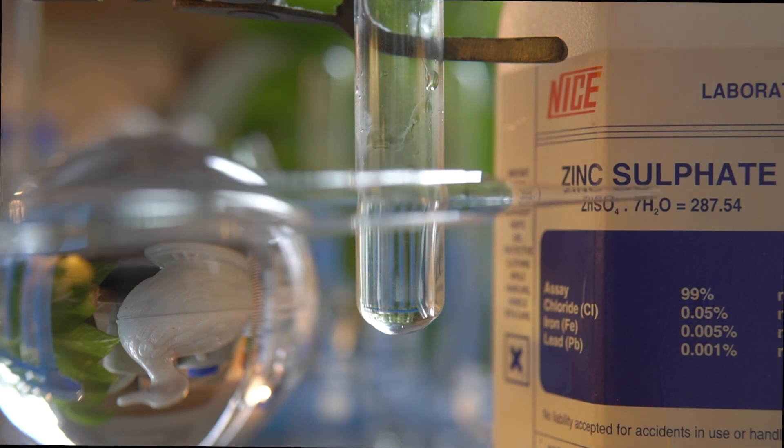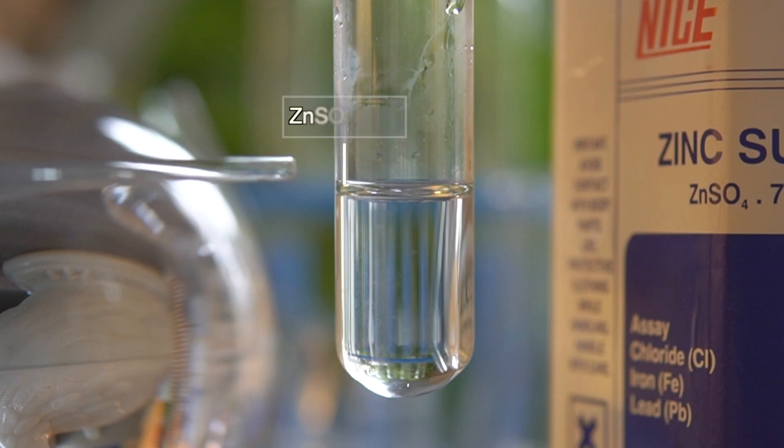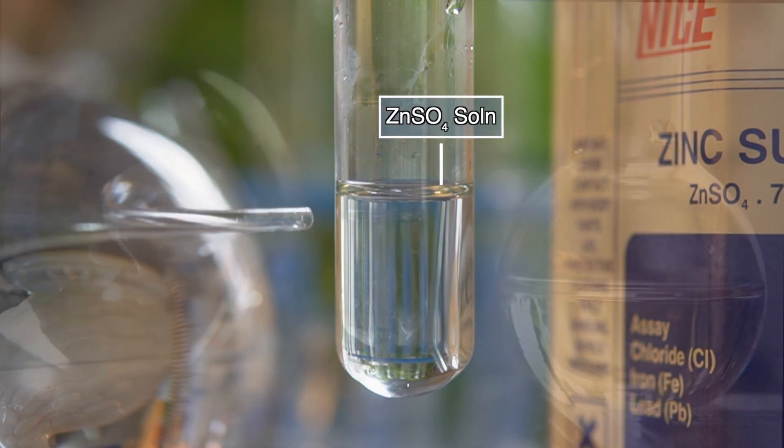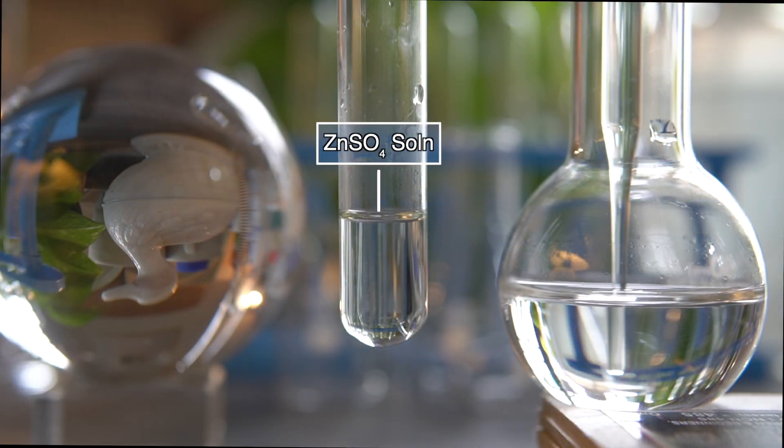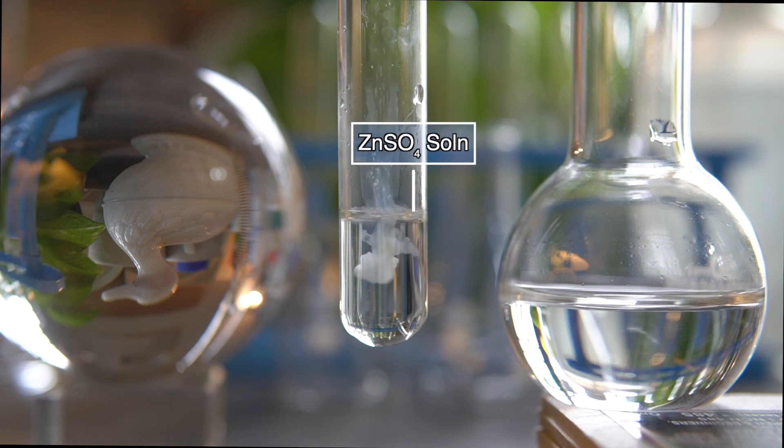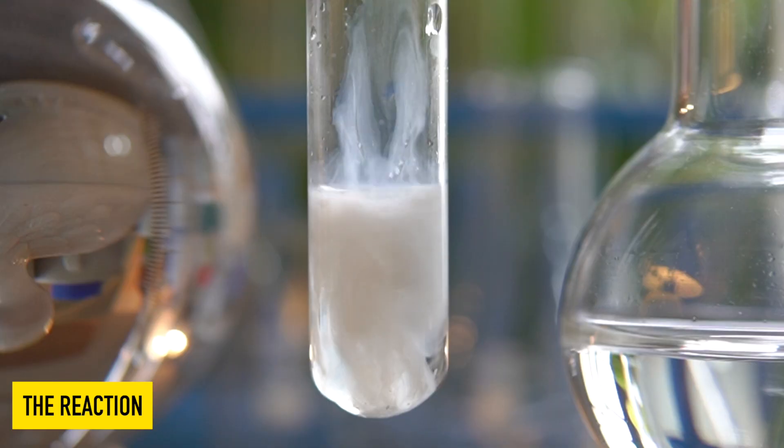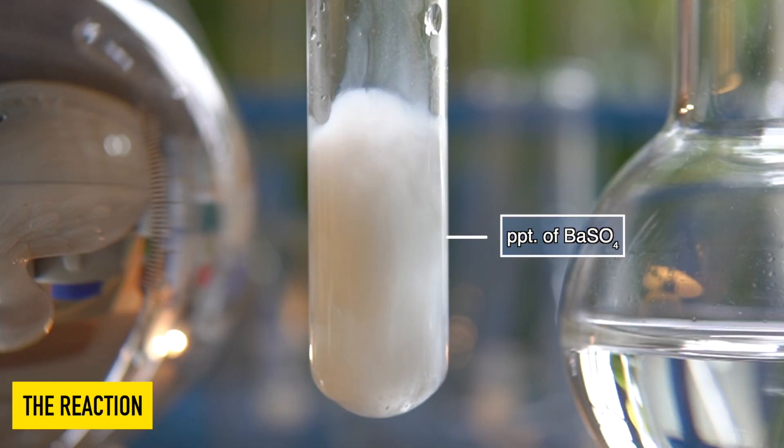To initiate the chemical reaction, we will take some clear solution of zinc sulfate into this test tube. Now we will add the clear solution of barium chloride dropwise on zinc sulfate solution slowly and observe the effects.